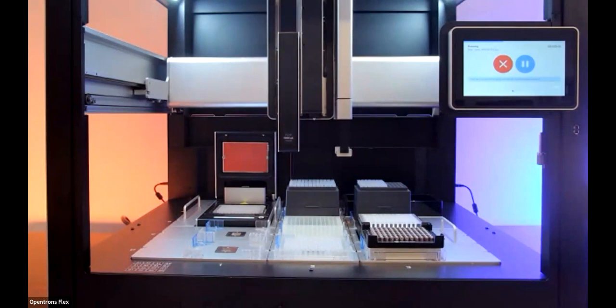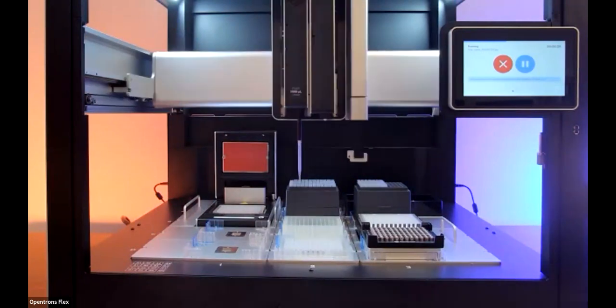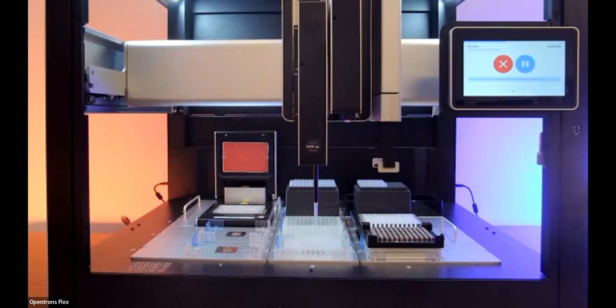Stephen Bates asks, is barcoding coming down the road? Accessioning is obviously a huge part of doing any kind of high throughput biology work. That is something that we are building into the Flex. This is not going to be a launch feature, but the ability to accession and handle samples is something that we have on our roadmap and plan to support in the future.